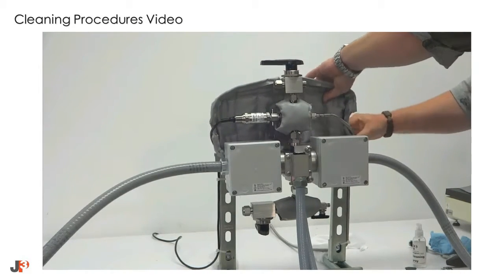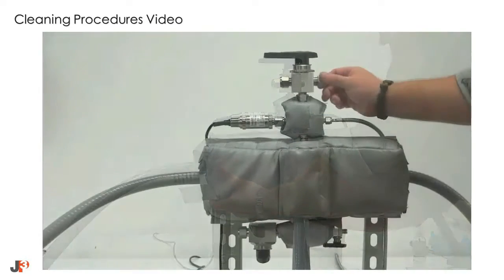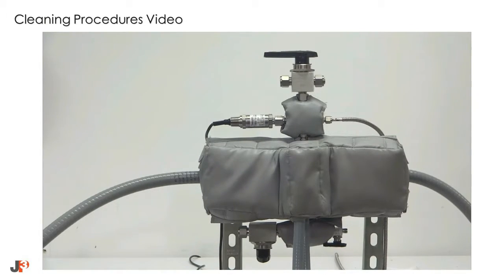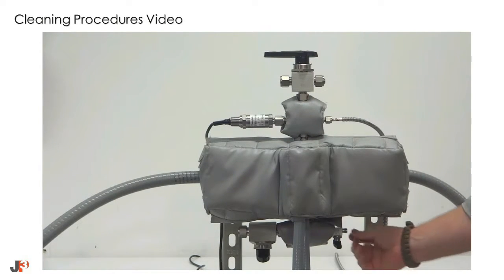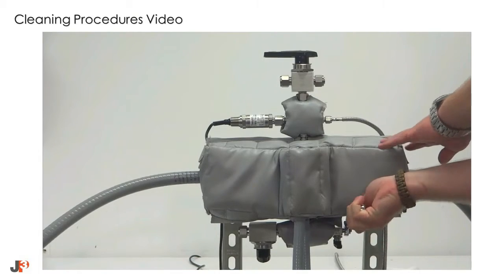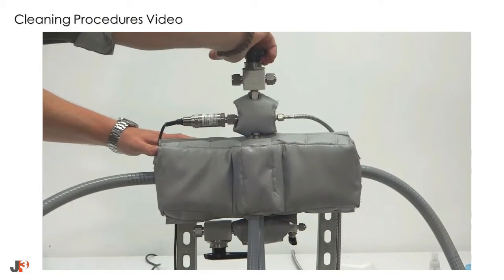Once both sides of the flow cell have been reassembled, reinstall the insulating cover. Ensure that both are closed and capped before trying to return process to the flow cell. Once the insulating cover has been reinstalled, you may re-energize the heating block and restore flow to the flow cell.